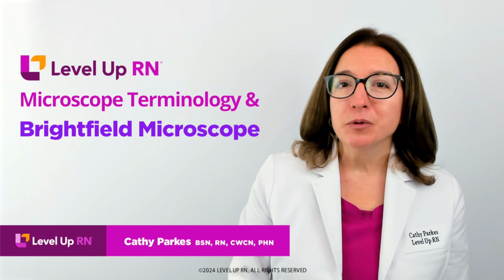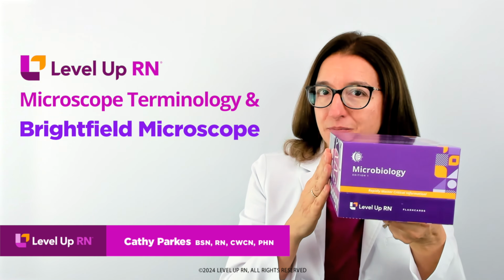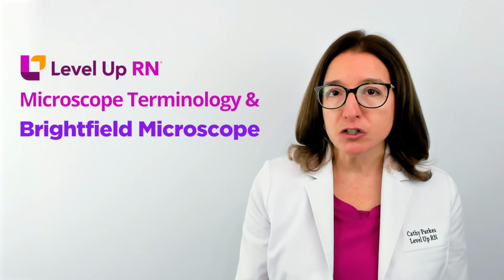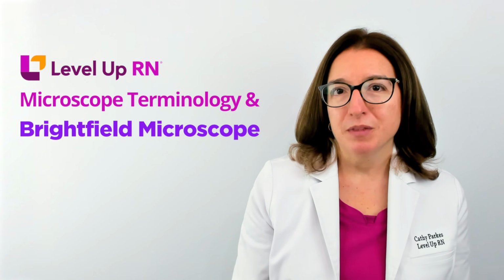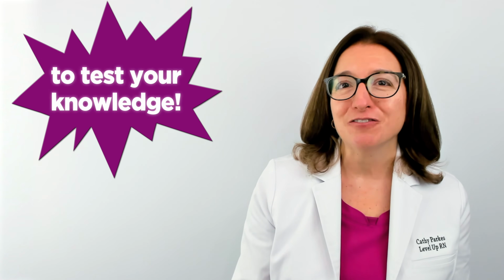In this video, I'm going to continue my coverage of topics from our Level Up RN microbiology flashcard deck. Specifically, I'll be going over some important terminology related to light and microscopes, as well as the different parts of a Brightfield microscope. At the end of the video, I'm going to give you guys a quiz to test your understanding of some of the key facts I'll be covering. So definitely stay tuned for that.